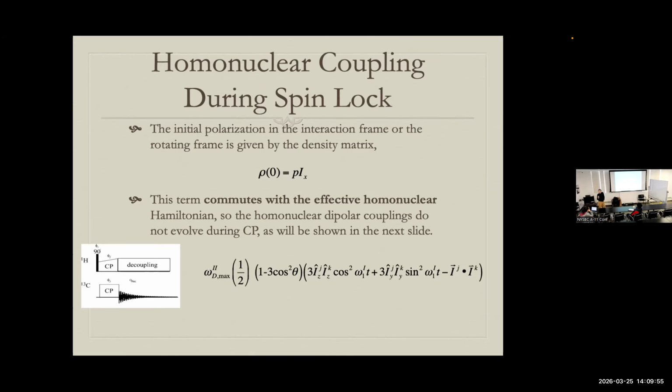In practice, though, you are right that unfortunate dipole coupling strengths and magic angle spinning do lead to making sort of strongly active homonuclear couplings. So this doesn't work at moderate spinning frequencies in practice. This is an interesting approximation for early times.